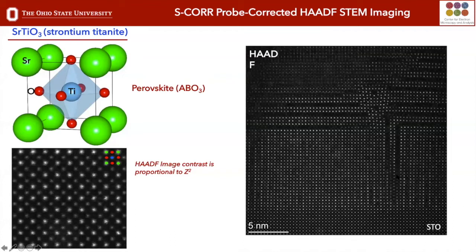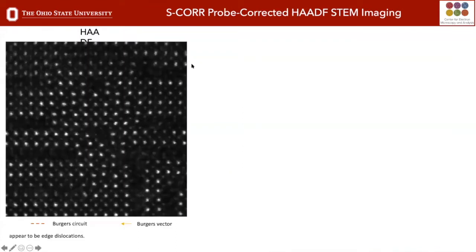But now from this image alone, we can start to see an extra dislocation plane. We can draw in edge-on dislocations here. And if we're really precise and blow this image up, you can easily draw a Burgers vector around this. If you're a metallurgist, this is something you probably did as an undergrad in dislocation class.